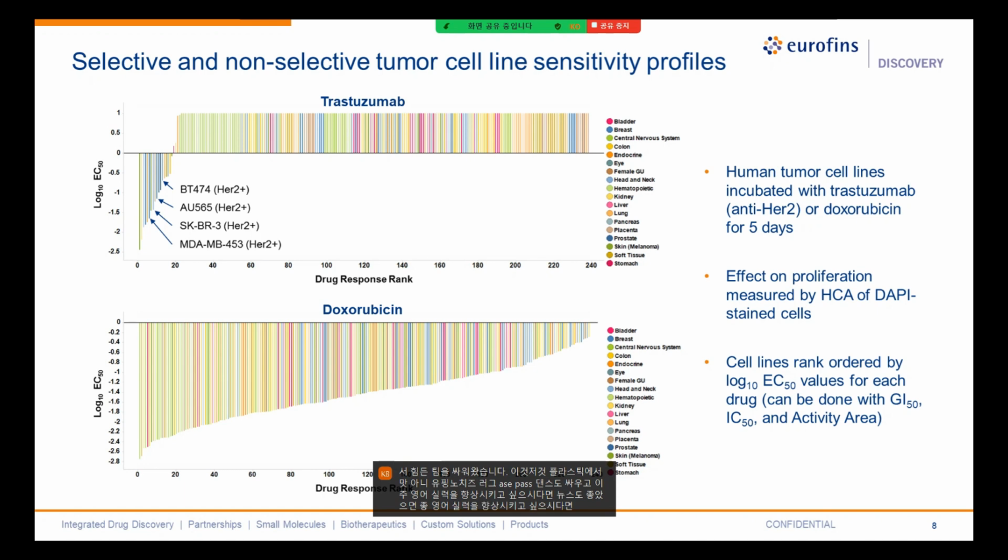There is a cluster of cell lines at the left-hand side that show sensitivity to different degrees to trastuzumab, and you will see the annotation here. There are several breast cancer cell lines there that are HER2 positive, and as we would expect, respond to trastuzumab. So we can see visually here that there may be some association of HER2 expression with trastuzumab sensitivity.